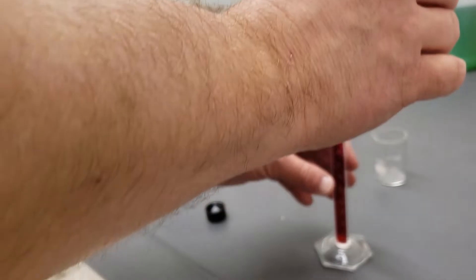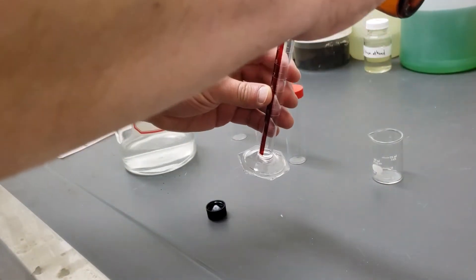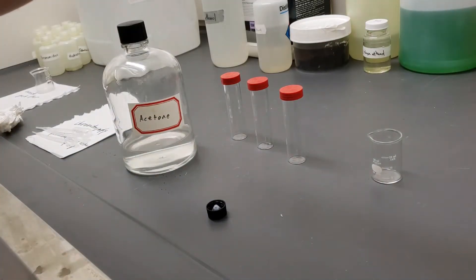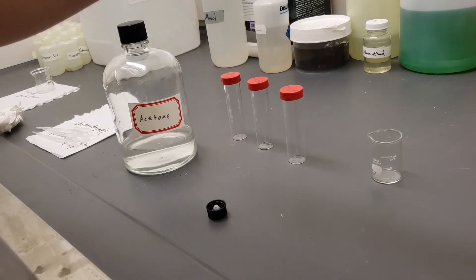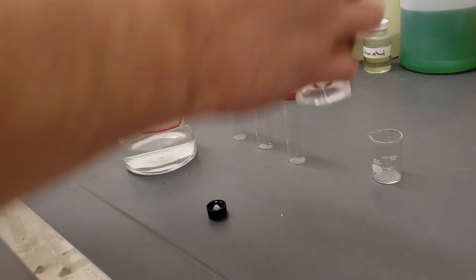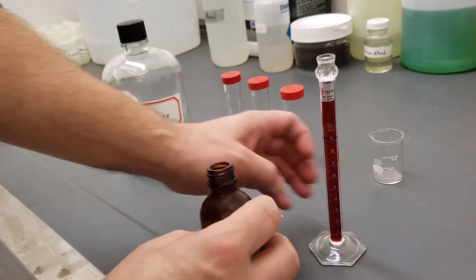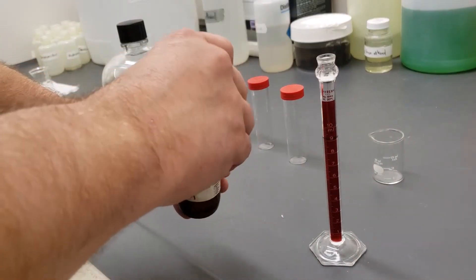I'm going to pour the petroleum ether into the graduated cylinder to nine milliliters. So I've got nine mils of petroleum ether.